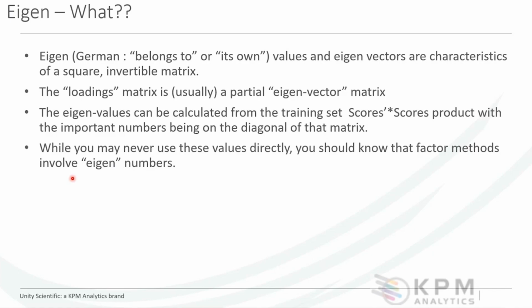You are not going to use these values directly. This is all done behind the scenes in the software. But it's very important that you understand what the mathematical reduction is doing and where these factors are coming from, because when you are developing your calibrations, you are going to be evaluating the performance of your models based on the number of factors that you're using.